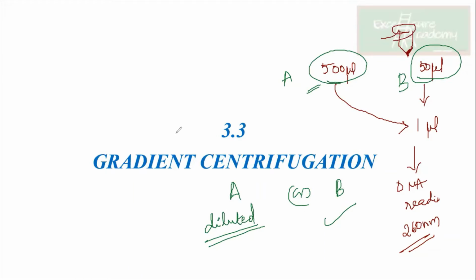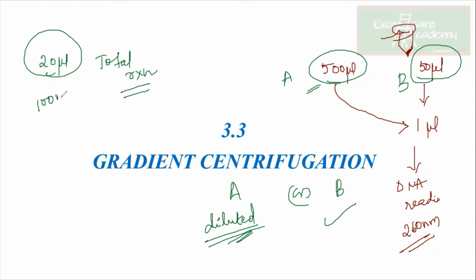Correct. अब क्या होता है in later stages when you're doing molecular cloning and whatever restriction enzyme digest या जो भी whatever work you do, you need to carry out everything in 20 microliter of total reaction. Now, if I have diluted reading, suppose I'm saying that it should have 100 nanogram of DNA concentration in order to start the PCR or whatever you are doing. This 100 nanogram should be in 2 microliter of the total reaction, क्योंकि total 20 microliter है, जिसमें से 2 microliter आपका DNA template होगा, कुछ forward reverse primer होगा, कुछ MgCl2 होगा, कुछ buffer होगा, कुछ microliter आपका DNA polymerase होगा, right? So total it should be 20 microliter.